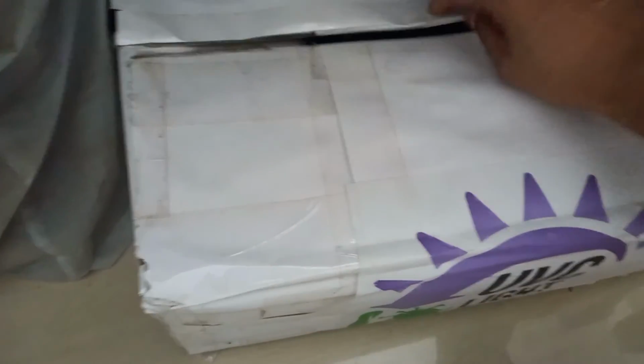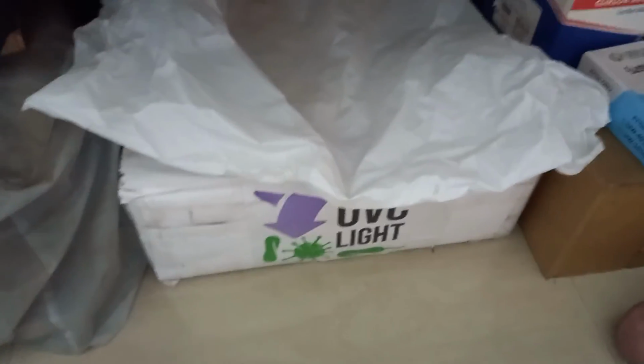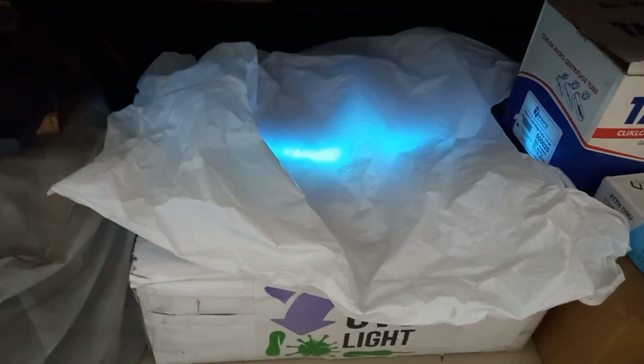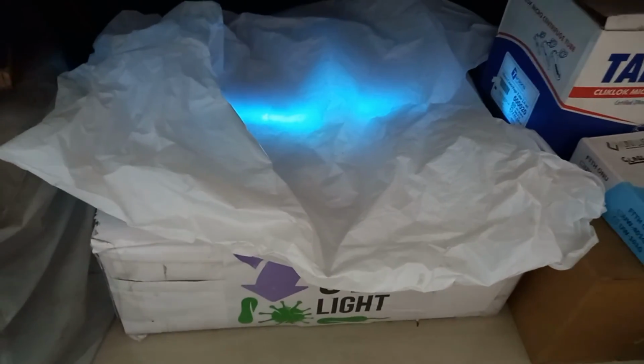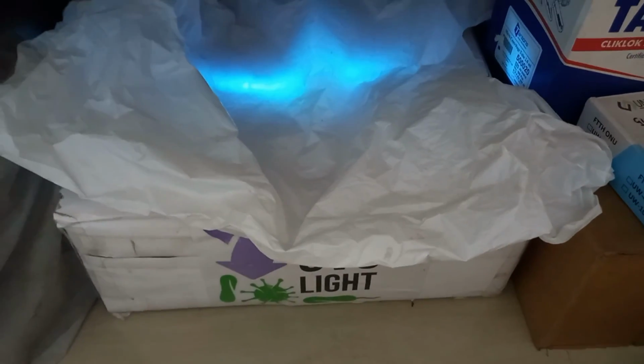There is a UV lamp. This is a simple UV lamp, a 1.5 feet lamp, and inside I have kept some flasks and test tubes and petri dishes and all that. You just close the box, put the box inside, and put a plastic cover over that, and simply switch on the light. This light will completely sterilize what you have kept inside.